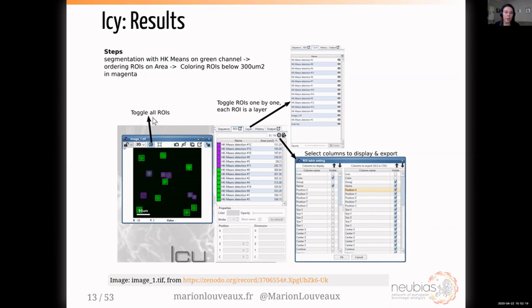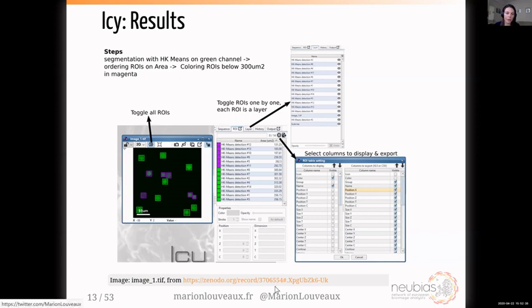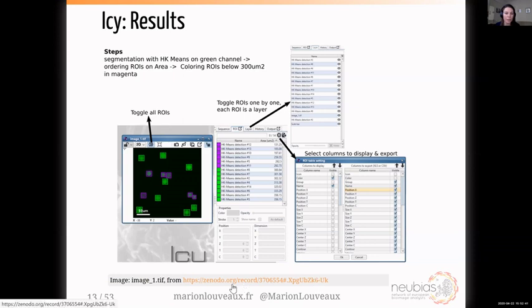You can toggle all the ROIs with the overlay button or toggle them one by one. Finally, you can export these results — you have the option to select first the columns you want to display and then the columns you want to export as an Excel file or CSV. This led me to introduce the second dataset I'll use for this presentation, also on Zenodo with a DOI. These are cell images from a colleague of mine, Jessica Quentin.